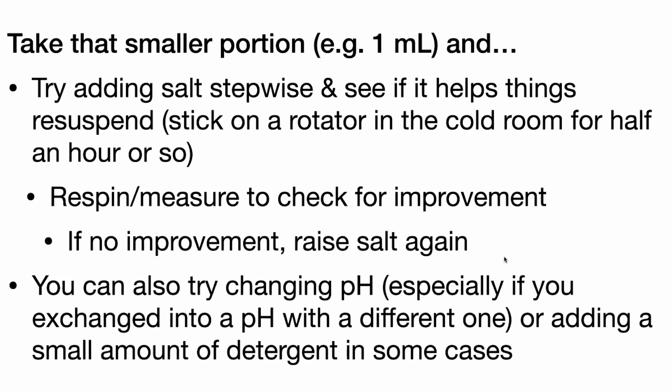When you're working with proteins, you want to keep them cold. Unless your protein is a weird case, it likes the cold, even if you don't like working in the cold room. It likes you working in the cold room, or at least watching from outside.